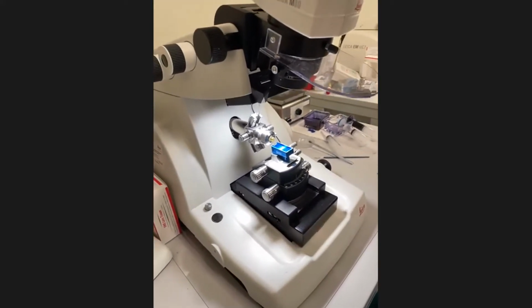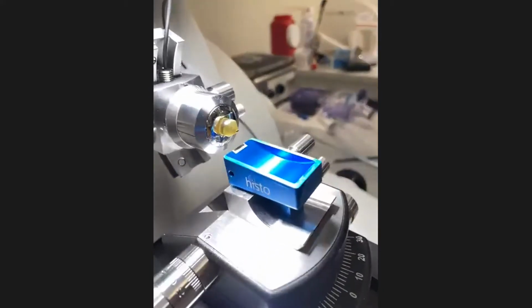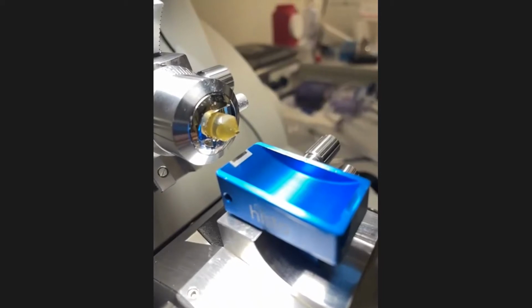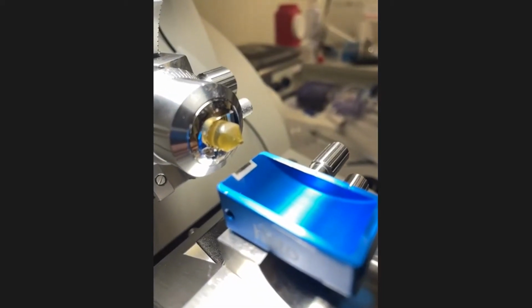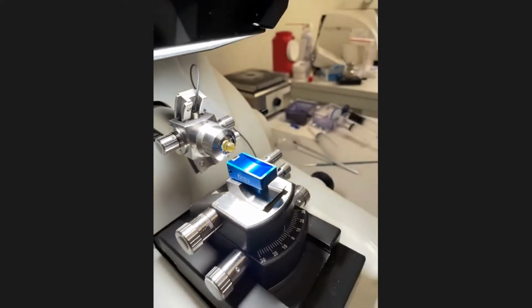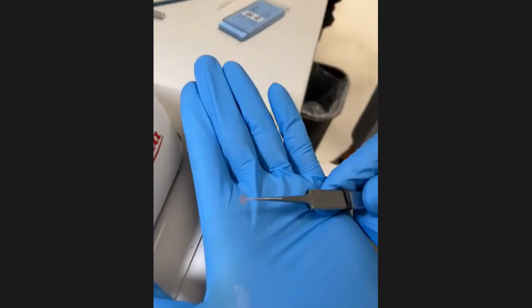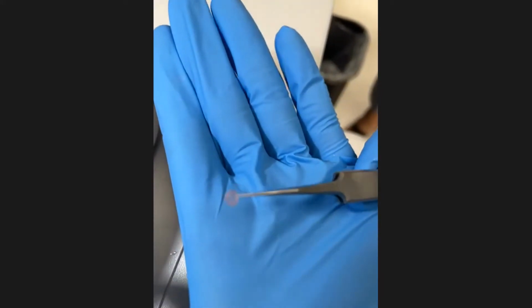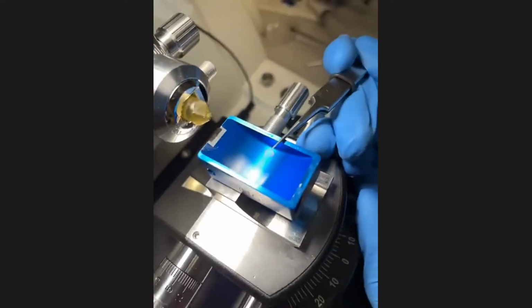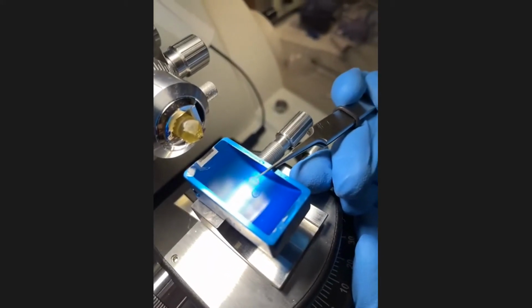So there's a little fleck of black on the end of this resin block that's mounted right in here, and that is the tissue that we're working with. And Bree, why don't you show them what a grid looks like, and tell them how you have to center that tissue in that grid. So the grid has 100 spaces, and we place the glom in the center grid space of the grid.